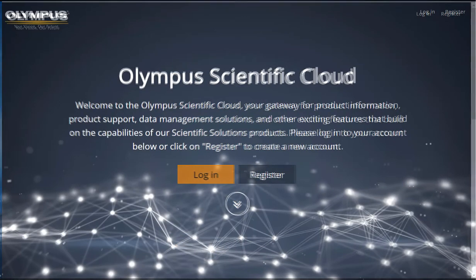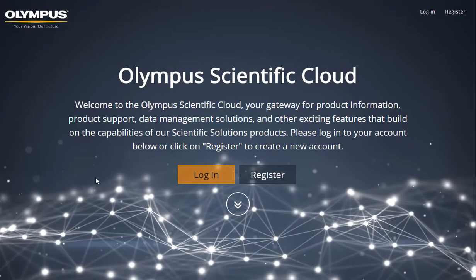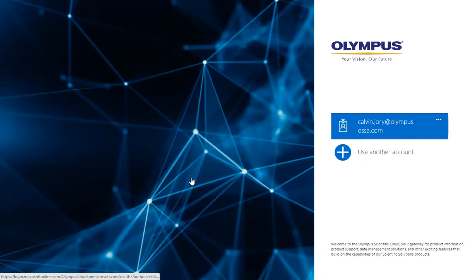Next, log into your cloud account by visiting olympus-osc.com.